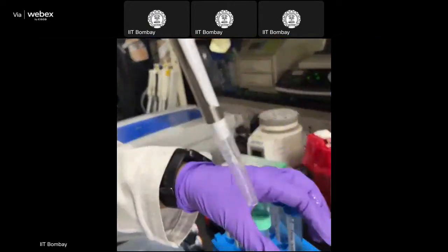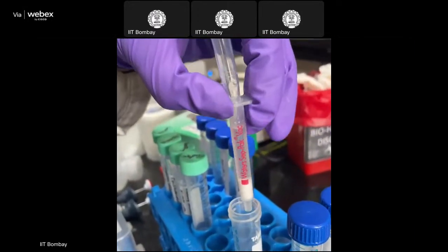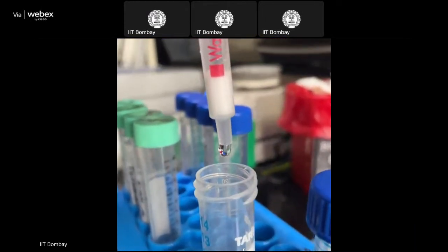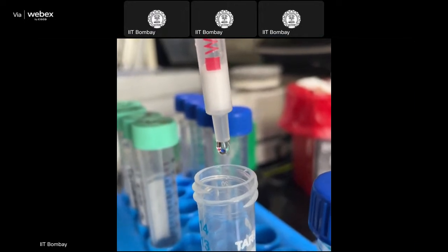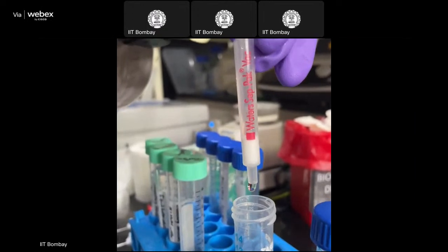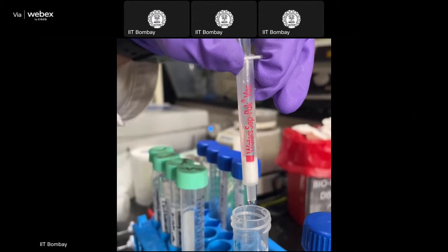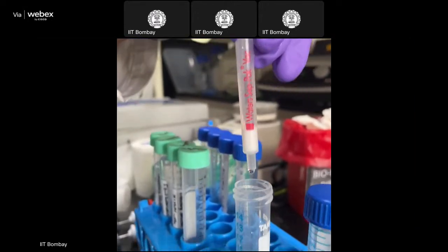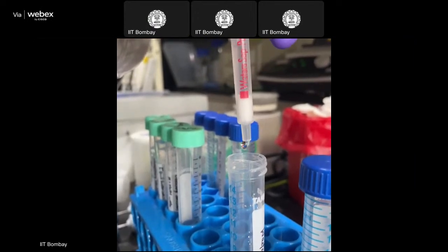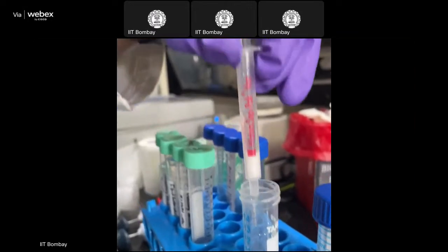So the sample should pass at a very slow rate, like 1 drop per second. Otherwise, the bed will get disturbed and the air will pass through the column. We should not allow air to pass through the column, otherwise it will get disturbed and our desalting won't be proper. So the timing is very important, 1 drop per second. This is how we do our desalting.